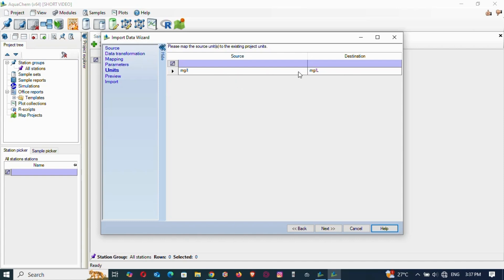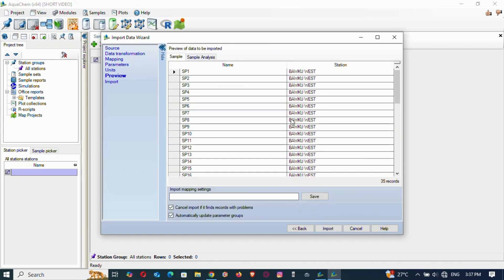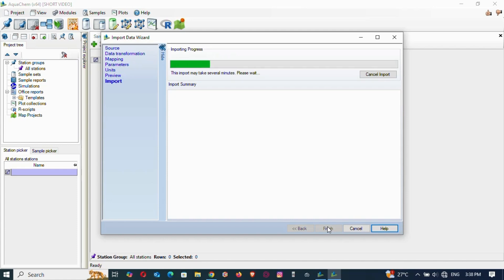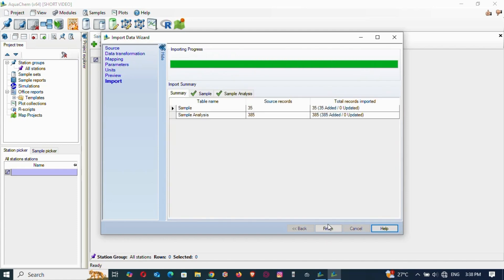Units are in milligrams per liter — same as before. These are the samples and we now have 35 records — 35 samples were selected as shown in the file. Sample analysis is all here as well, so let's just move on. Everything is OK with 35 samples — let's finish.